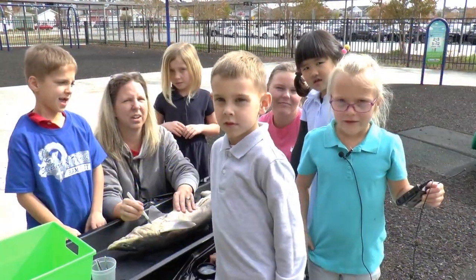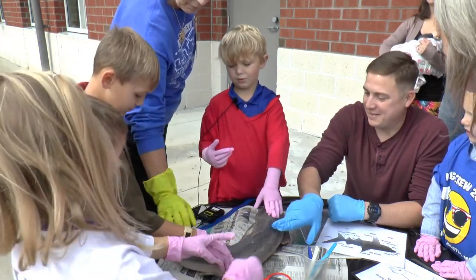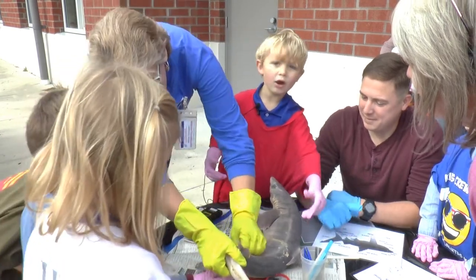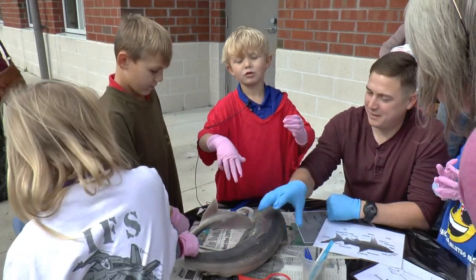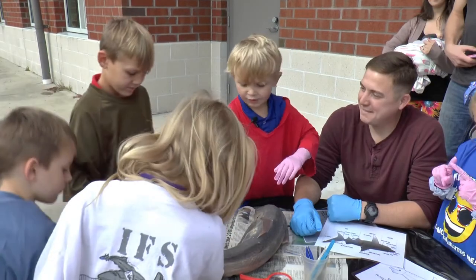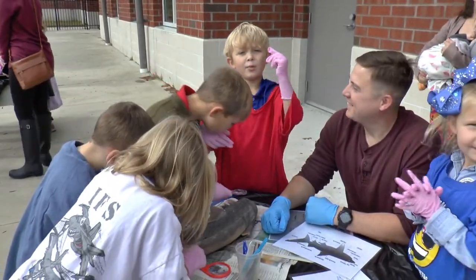Sharks have cartilage and they don't have any bones. It's hard sandpaper. And on his dorsal fin there's a spine. If somebody tries to bite him on a dorsal fin, they get a spine in their mouth. His other dorsal fin, if they're gonna bite him by a tail, he'll get a spine in their mouth again too.